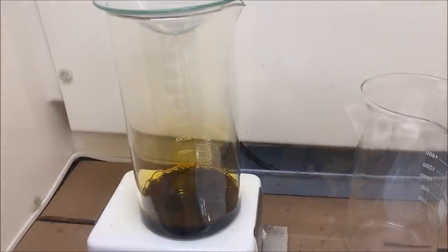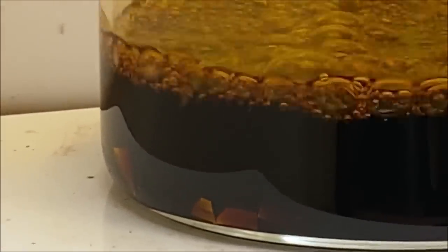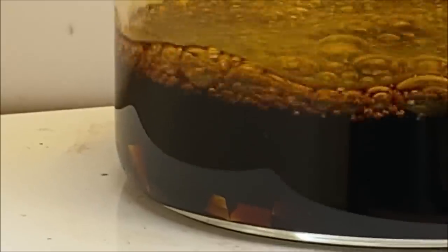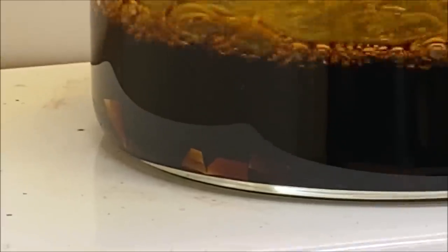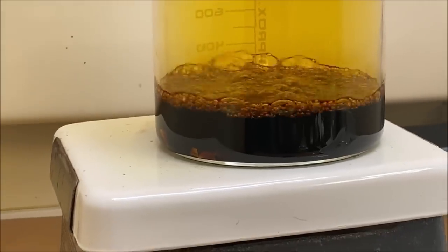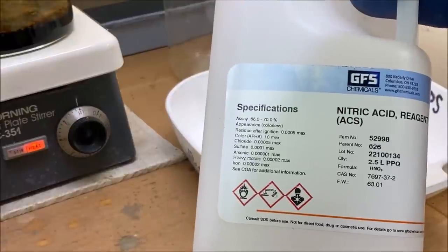For some reason my little stir bar there quit working. There we go. Yeah, you can see over here there's still some solid chunks of metal down in the bottom of the beaker. Just leave this on the heat and let this react. All right, let's put in a little bit more nitric acid.